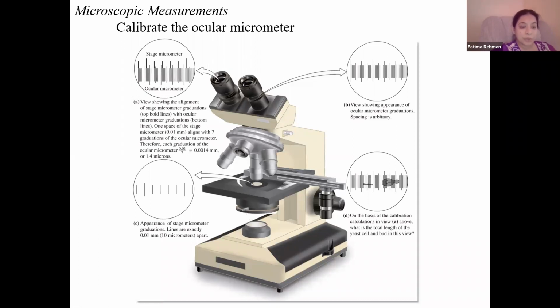That's what I usually did: I would go by the student and switch the aperture to the lowest setting, so less light was coming through, and lo and behold, cells would appear. So that's the other thing you can do. Good job. So that's our general microscope.